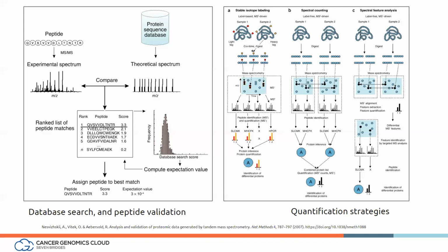So basically what the pipeline is doing is, we start with the database search, more specifically using a tool called MSFragger. MSFragger is an ultra-fast database search engine that we published a few years ago. It's so fast that it allows you to do what we call open searches, which is the ability to do a database search without restricting for delta masses. So the database search is the first step, which allows you to match the spectra from mass spectrometers to a protein database.